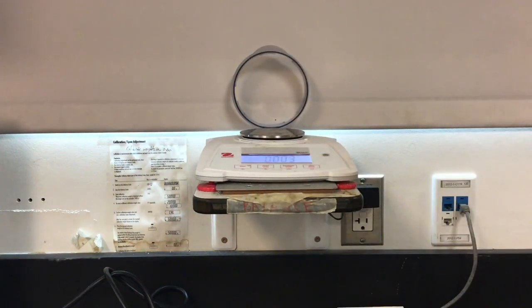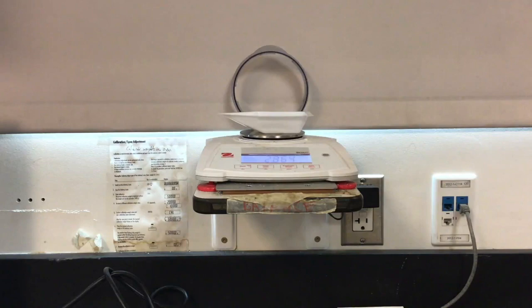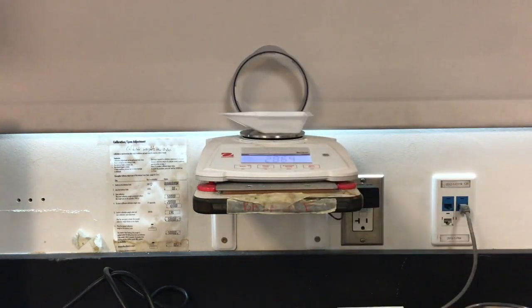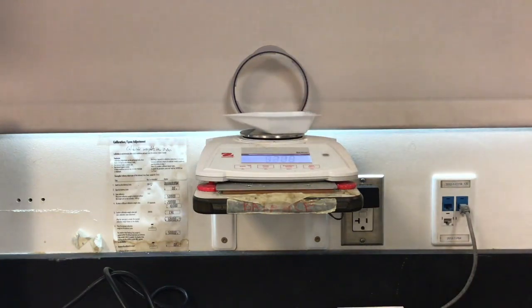Now our solute in this part is our copper sulfate pentahydrate. So we need to weigh that out. So first we're going to weigh our empty weighing boat. It's about 2.8 grams. We want to weigh out between 2 to 3 grams of copper sulfate pentahydrate. So we'll add to this. We're at 2.8. So we want to have at least 4.8 to about 5.8 grams. Okay, so 5.2 is within our range.